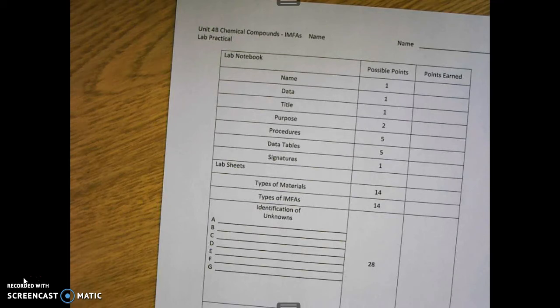So when you go into the lab, you cannot take any supplies with you in terms of resources, just what you've learned. So make sure you are very comfortable with the kinds of properties that each of these materials are going to show. Make sure you know what ionic compounds will do. I will let you take solubility rules, however, because you don't have to ever memorize solubility rules. Make sure you know what metallic properties do. Make sure you know what molecular polar and molecular nonpolar things do. So that's the kind of information you want to walk into the lab having in your head, because you cannot rely on any papers in order to do that.